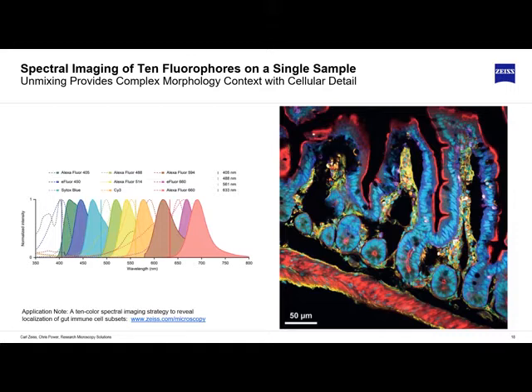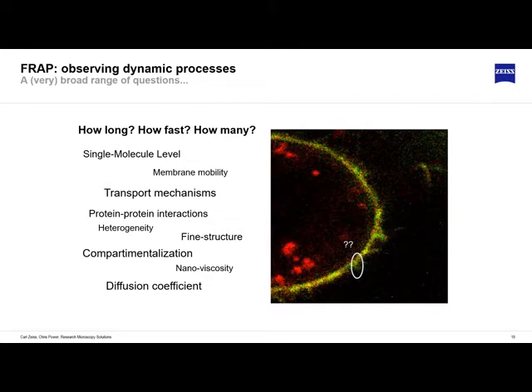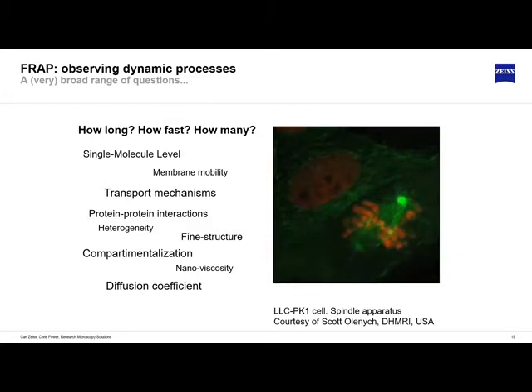And then confocals also offer other abilities beyond imaging. An example here would be fluorescence experiments such as photoactivation and photobleaching, where you're looking at dynamics within your sample. Here you might be asking, how many molecules do I have? How fast are they moving? Within the confocals, we can take a series of images, a time series. We can then apply high laser power, bleach a sample, and see how quickly that recovers.